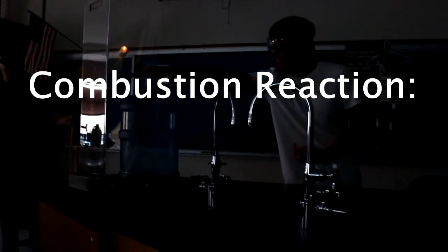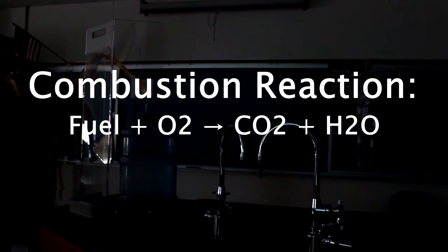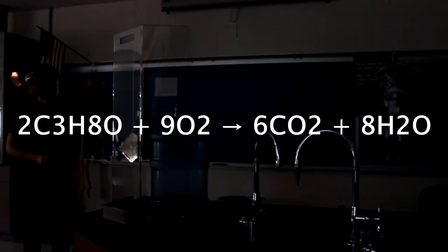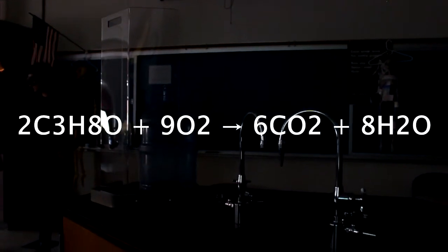This experiment is a simple demonstration of a combustion reaction. In a combustion reaction, a hydrocarbon is burned in the presence of oxygen gas, forming carbon dioxide and water vapor. The equation for the reaction of isopropyl alcohol is 2C3H8O + 9O2 yields 6CO2 + 8H2O.